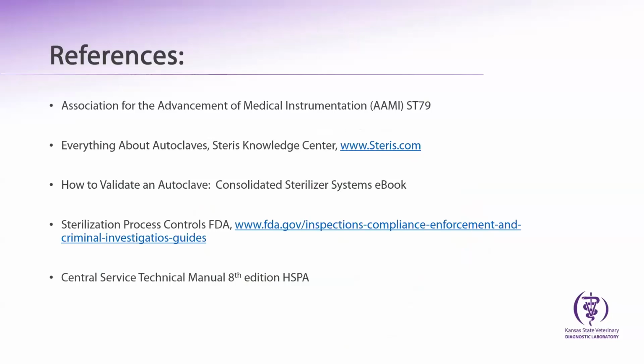There is a set of references there. Okay, for those of you that are actually here in the room, our vendors have donated some pouches and stuff. So if you guys want to come up this way, we're gonna build the test pack. And this is actually kind of the way EH&S is gearing to make everybody do verification. So if someone would please bring those two back there up this way on their way by, those two biologicals there on the table. We're gonna build some test packs right quick.